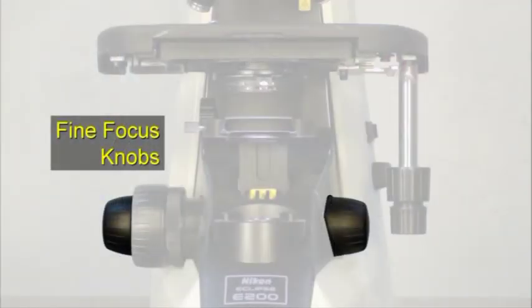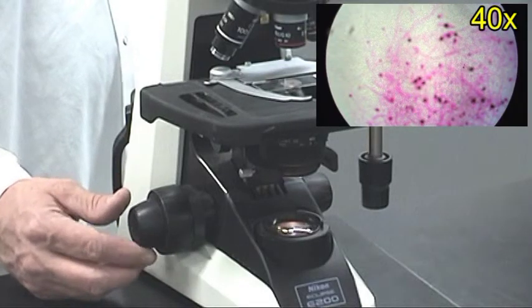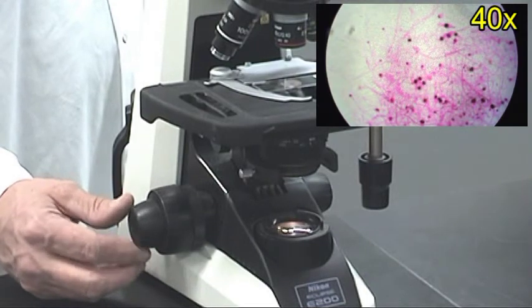The two smaller knobs on both sides of the microscope are fine focus knobs. They move the stage in small increments to sharpen the image.